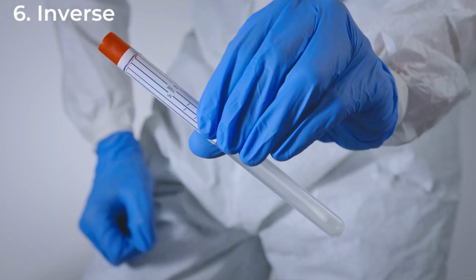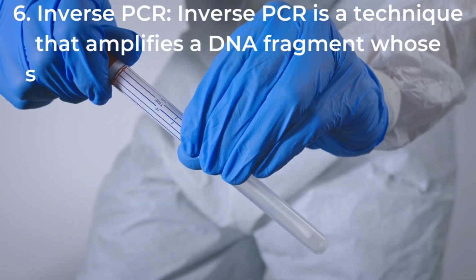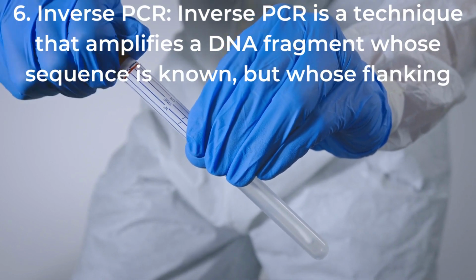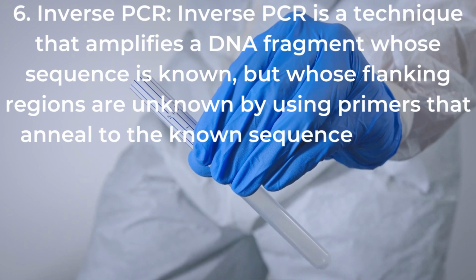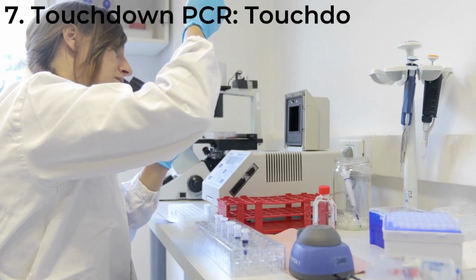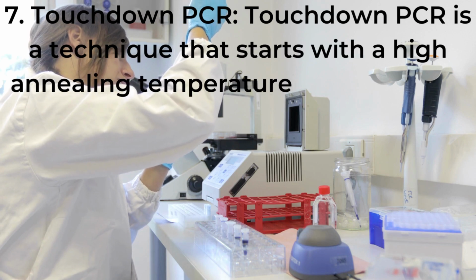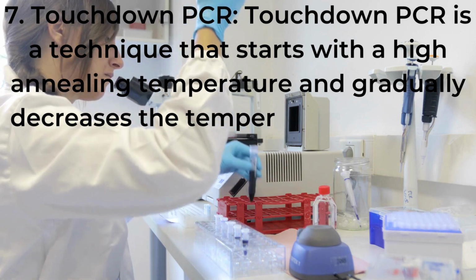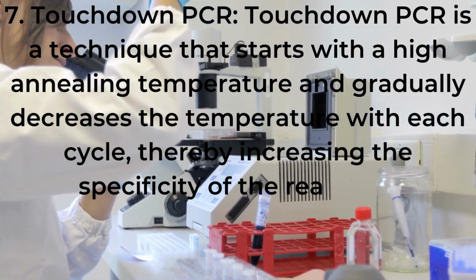6. Inverse PCR. Inverse PCR is a technique that amplifies a DNA fragment whose sequence is known, but whose flanking regions are unknown, by using primers that anneal to the known sequence and then amplify outwards. 7. Touchdown PCR. Touchdown PCR is a technique that starts with a high annealing temperature and gradually decreases the temperature with each cycle, thereby increasing the specificity of the reaction.